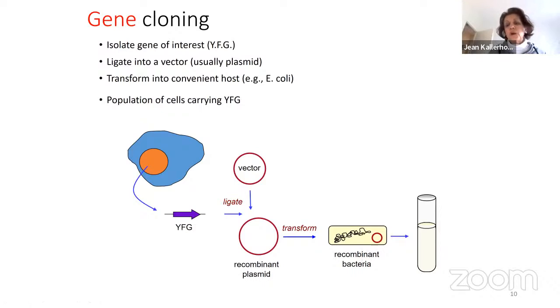And therefore, once you have screened your recombinant bacteria on selective medium and on X-gal containing medium, you will hopefully eliminate 90%, and you can only work with 10% remaining ones.